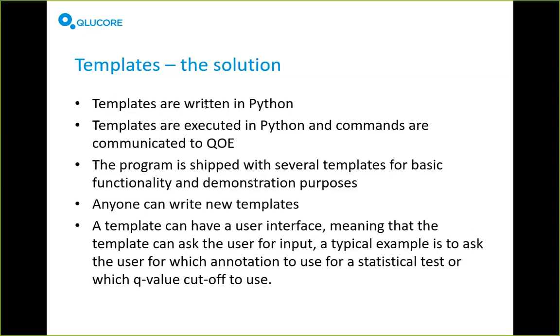It's easy to learn for those of you who don't know it, if you want to write your own templates. Also, there's plenty of literature out there. There's plenty of help on the internet to get to learn Python. So I believe it's a good choice of language for this kind of application.